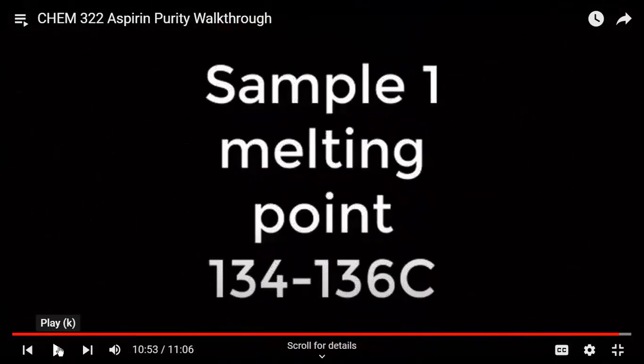All right, so if you're using sample 1, the pure melting point, and only one trial, no, it says 2 trials on the handout, only one trial. If you're using sample 1, the melting point is 134 to 136, right?